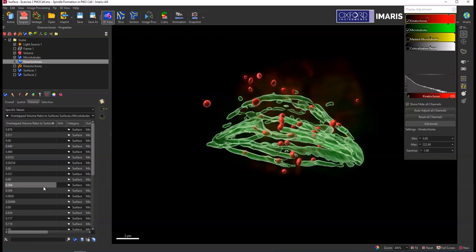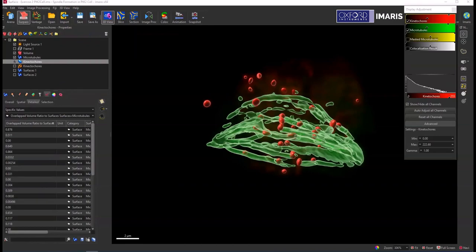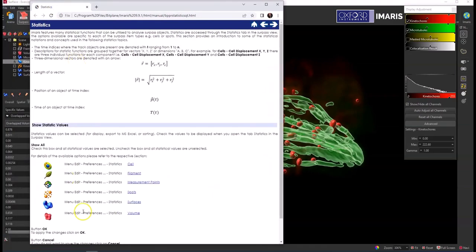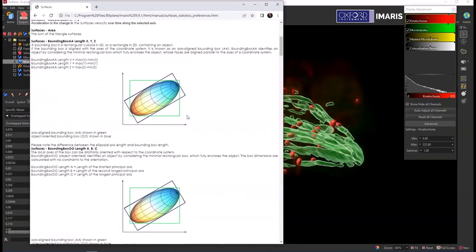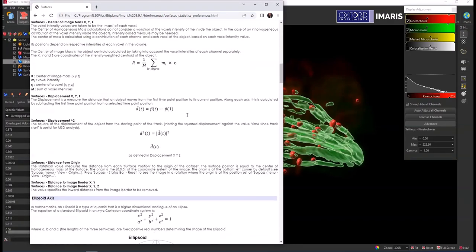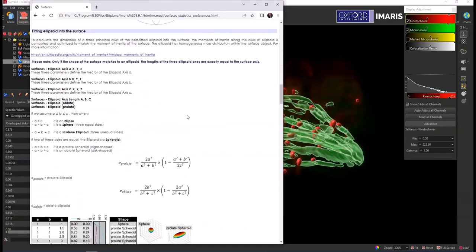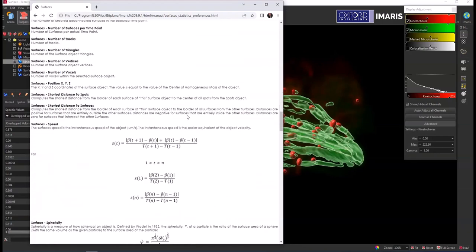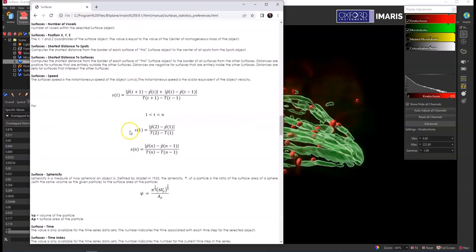And so more information about all of these statistics can be found by selecting help statistics reference, a new window will pop up, you'll then select surfaces, and then you can go and do a search or just scroll down to find the object-object statistics, and so then you can see what the definition is for those and how they're actually calculated.